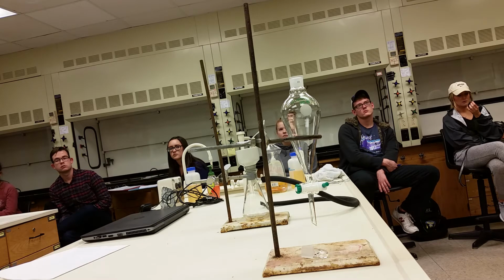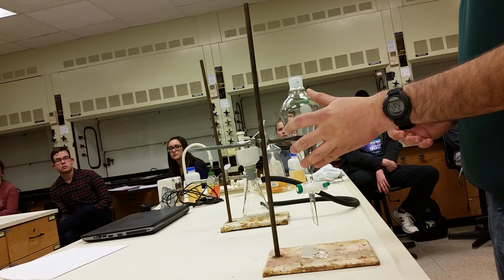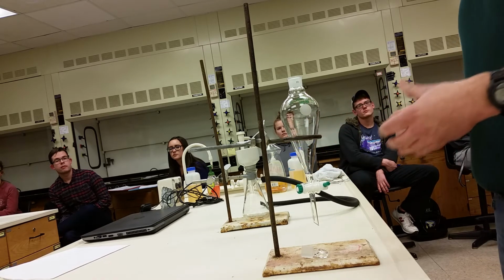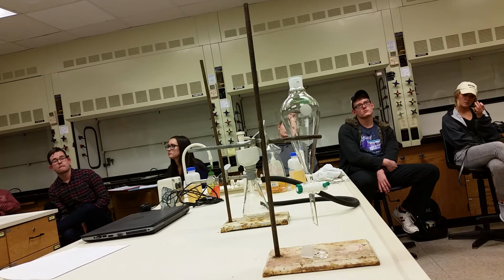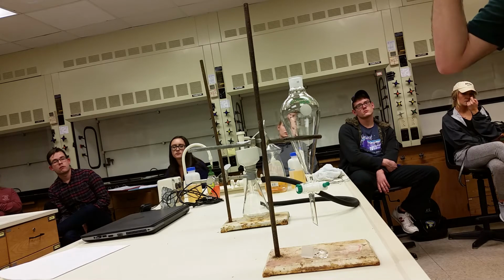And now we have to see if you have any compound in it. You have ethyl acetate left over. You might have compound in the ethyl acetate. So we're going to deal with that one too. To deal with the compound that you still have in the ethyl acetate, if there's anything left in there, you need to do a workup.